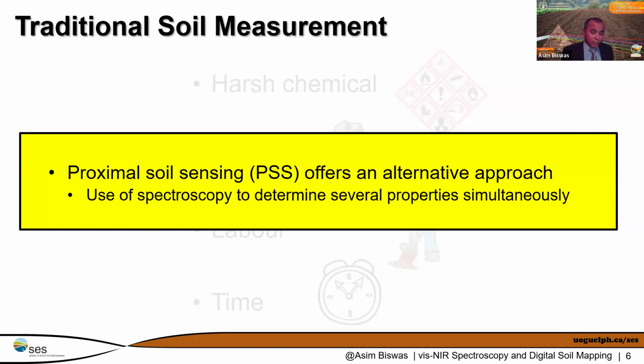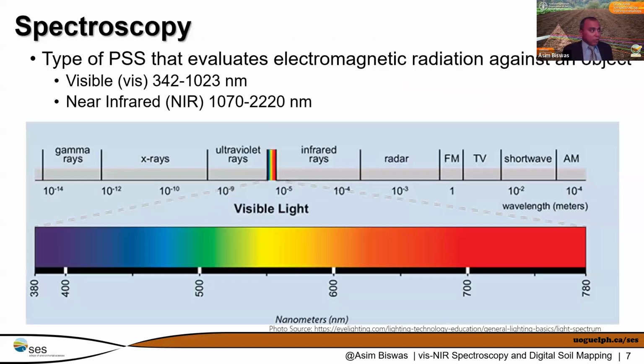And that's why we are having this platform today, and we're talking about GLOSOLAN Spec. The FAO-GLOSOLAN Spec initiative is what we wanted to come. We wanted to see a globalized approach where spectroscopy and other sensor-based measurements could come in, particularly how we advance our soil spectroscopy research and spectroscopy-based soil analysis so that we can make better decisions. Now, what is spectroscopy?